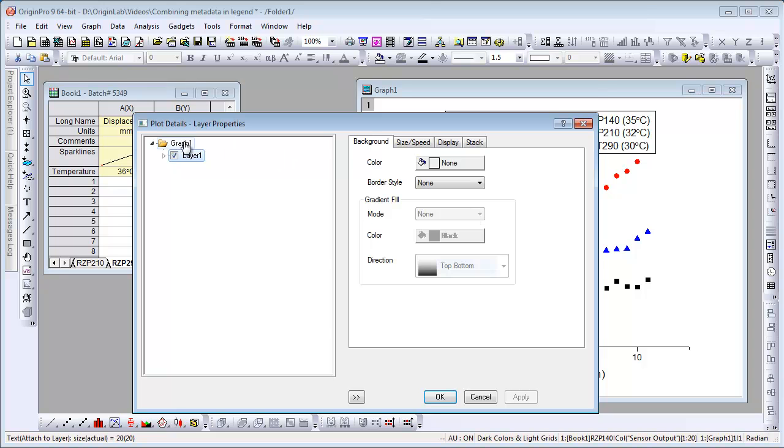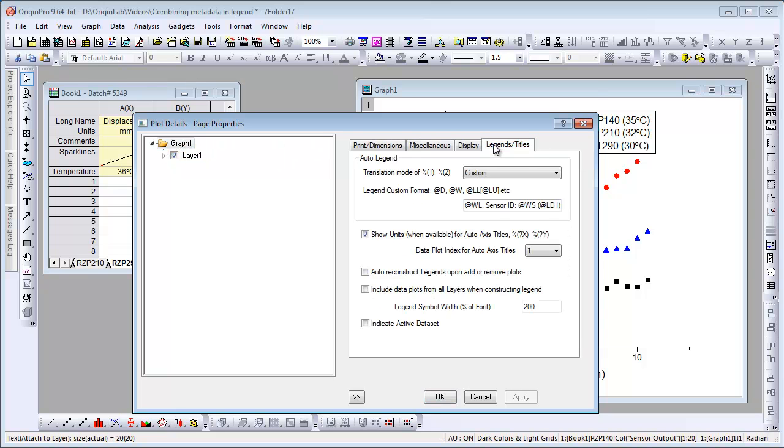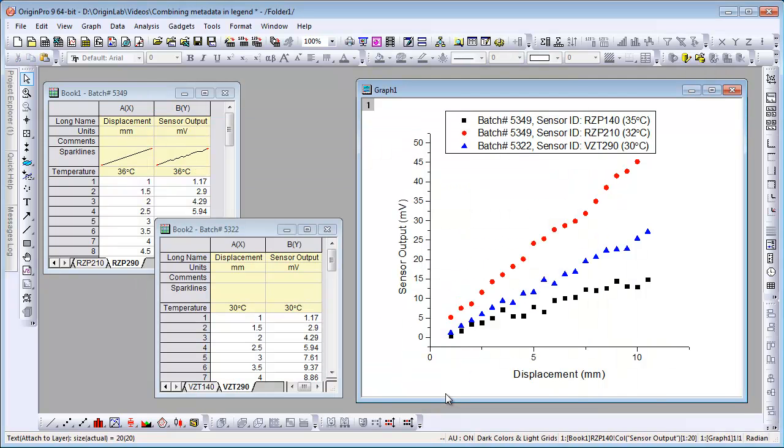We double clicked on the plot to open up plot details and the legends titles tab also has that same information. So you can also update your legend from plot details as well. This concludes this presentation.